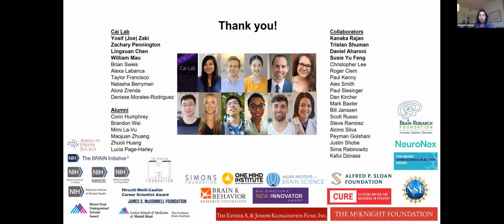While in the past it has been more difficult to get external funding to continue and support the development, Minian is a really good example of ongoing support and continued maintenance of the package. And I think that will grow more and more across time.